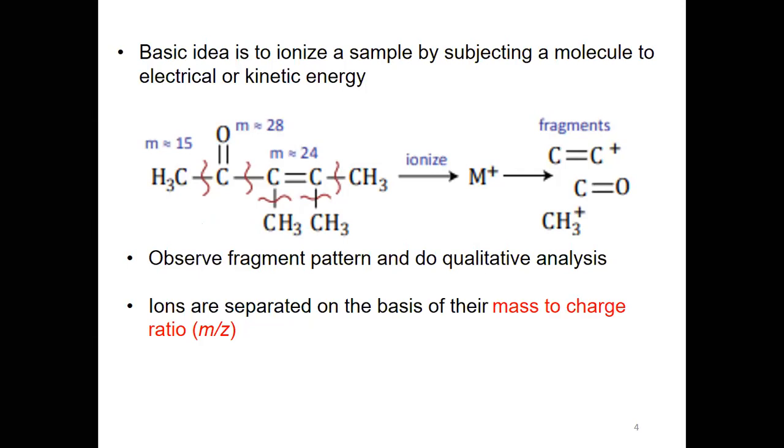And when it undergoes ionization, fragmentations will be there. Based on these fragments, we observe the fragmentation pattern, and based on the fragmentation pattern, we do the qualitative analysis. And those ions are separated based on the mass to charge ratio.